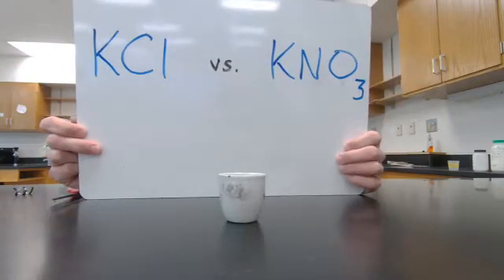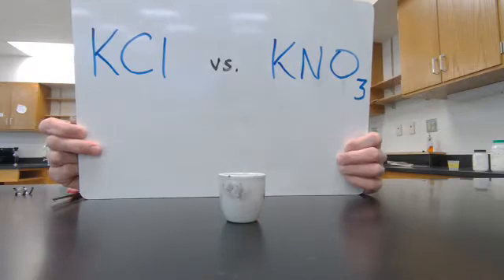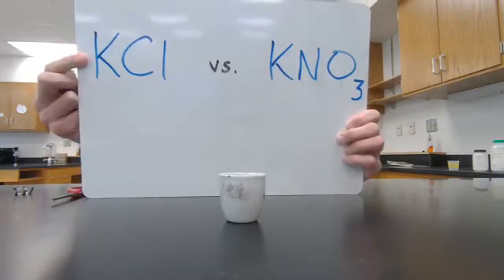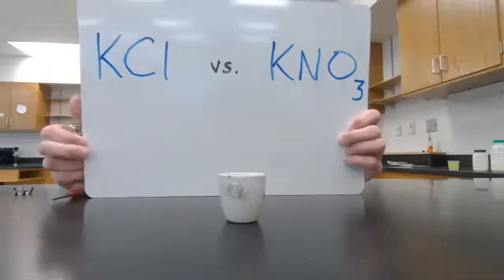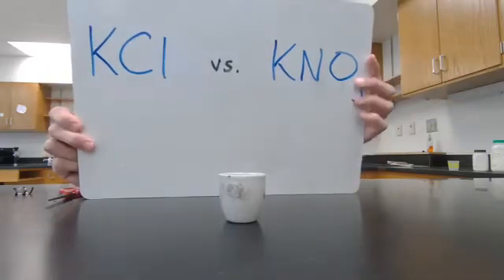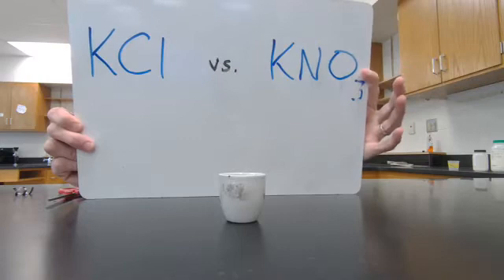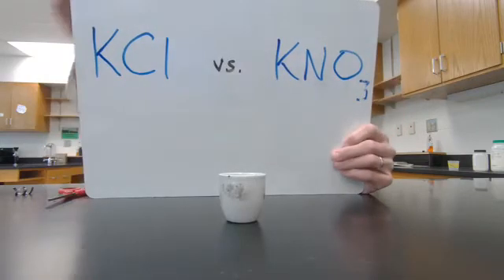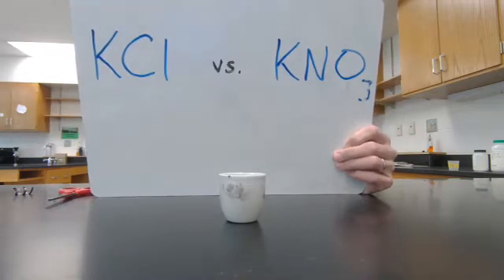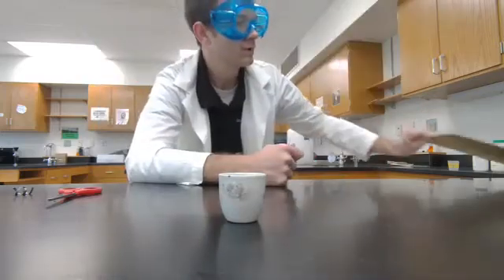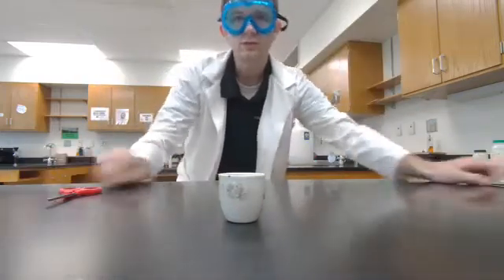This first one, I'm going to be adding hot magnesium to potassium chloride and we'll see a result. And then the second time around, I'm going to show you this oxidizer, potassium nitrate, and how these two particular metal salts compare, even though they both contain the metal potassium. So I'm going to demonstrate that to you.